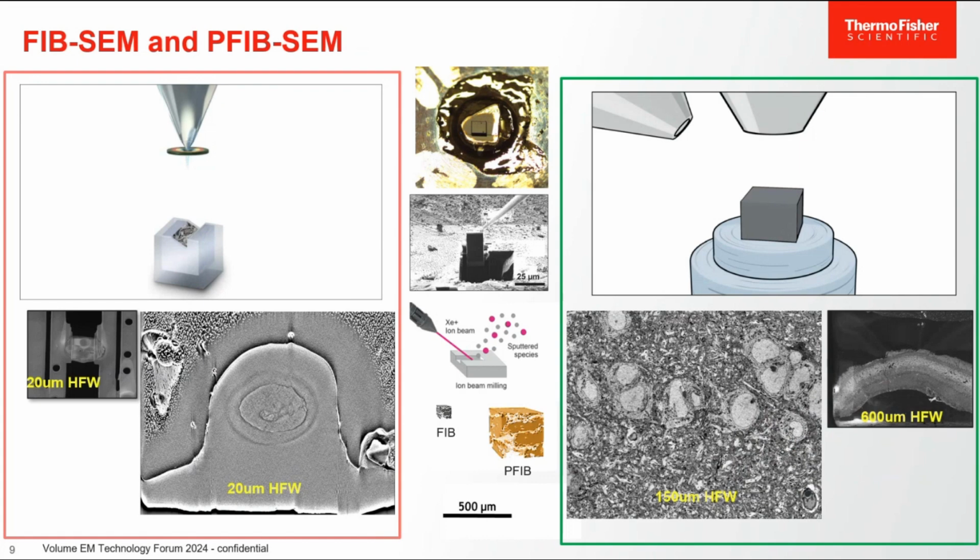The pFIB just means that you're sputtering things more aggressively, typically, and also with different plasmas, you can have some chemical reactions with the beam itself to give you some enhanced etching properties. So it's basically going a little bit faster. Most of the applications for pFIB-SEM are at the, should we say, the bulk milling steps. If you're doing fine milling, we still tend to be milling with similar currents to gallium, but you're able to open up much larger areas or do much larger studies with plasma.